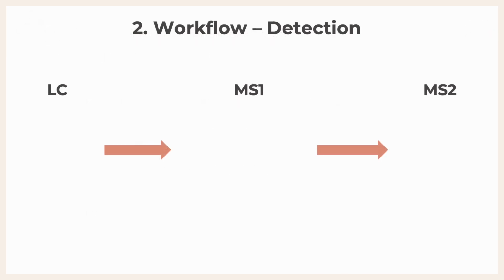And so I recognize that could have been a lot of information regarding instrumentation to process. So here is hopefully a helpful tool, a visualization of what happens during the instrumentation, that could help you understand it better, right? So here's our sample. The red is our specific analyte we want to pay attention to, which we're going to follow along, right? And I want you to keep in mind, this is just a general instrumentation workflow. So keep in mind what our analyte or what our starting sample might be if we did the bottom-up method or the top-down method, okay?